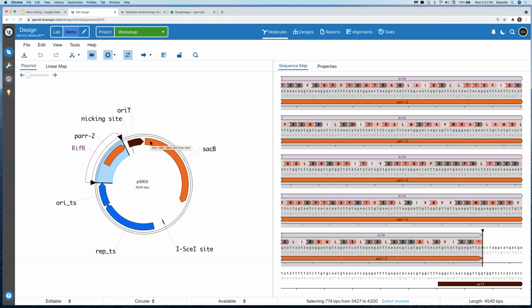And the reason for creating this concept of DNA part is very pragmatic. Basically, the DNA part is what will be used by our algorithm, and it will tell our algorithm exactly what DNA you as a designer would like to see in the final output construct.